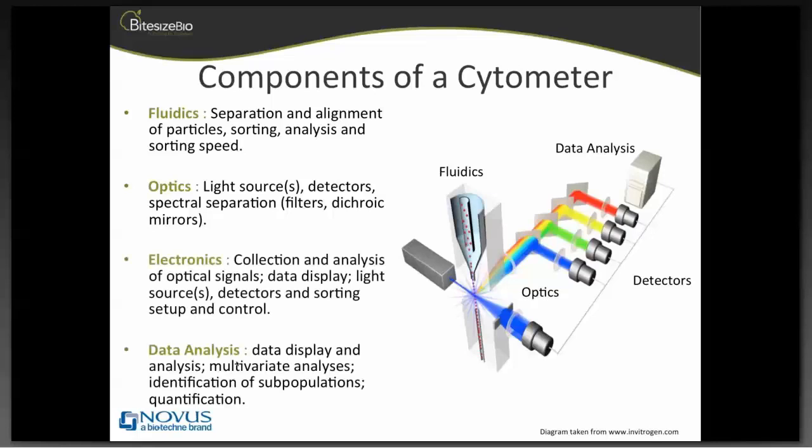We want to look at the electronics. That's how we collect and analyze the optical signals, how we can display the data, and then we look at how we can analyze it, how we can look at it on the screen.